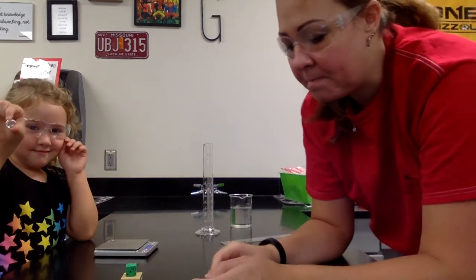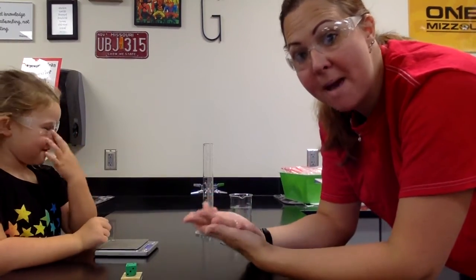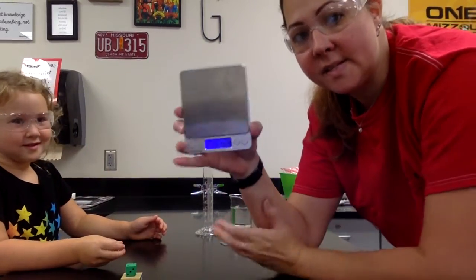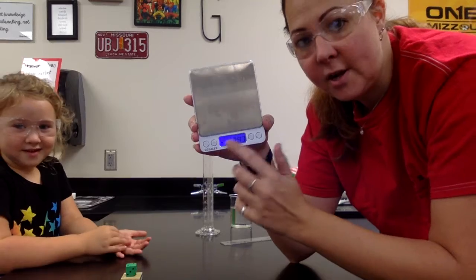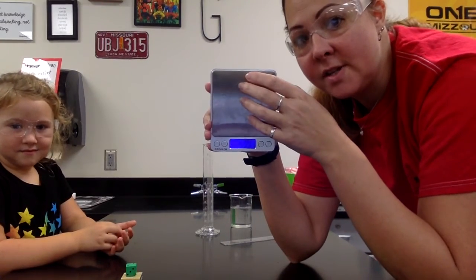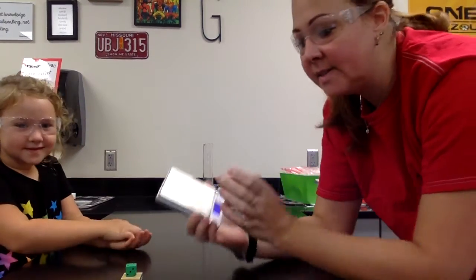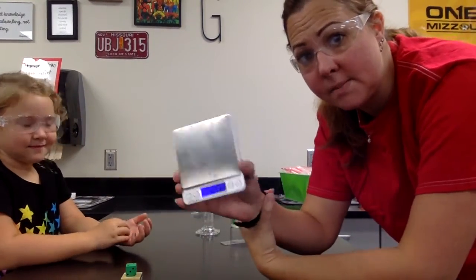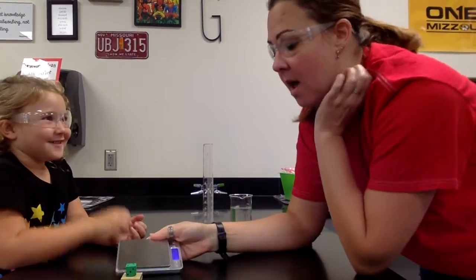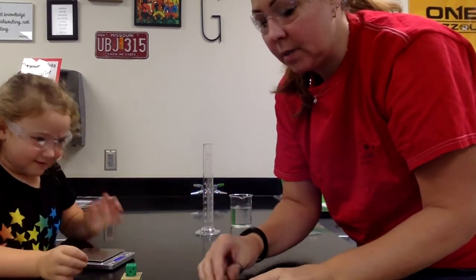For the first line of your lab, it asks you to find the mass of all of these different objects. So I've got a balance here. It's going to look crazy right now because it's up and down. I'm going to put the object onto the balance, and when you put the object onto the balance, it's going to tell us how many grams mass. Remember, mass is how much matter is in something, how many grams it weighs. So we're not going to do this object, Lily. We're going to do this one.